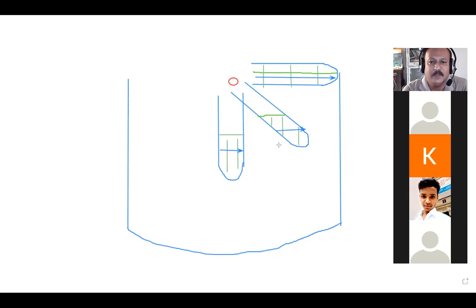Yes, sir. Okay, so now you can just see the difference. The distance which the components travel is the minimum here. A little more distance here in the fixed angle tubes, and in this situation the sample components are moving the maximum distance, and in fact they are going to the bottom of the tube. Is it right? The sample components are moving to the bottom of the tube.